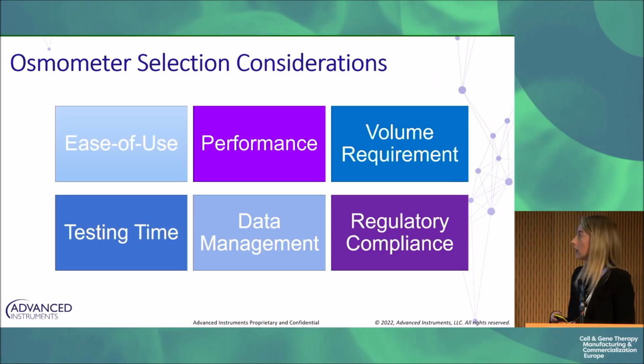Volume requirements, obviously within PD, we know sample is precious, so the smaller that volume used for this test, the better, as well as testing time. You don't want to be stood around waiting for hours. This is a very quick and efficient test that we need to get done ASAP.